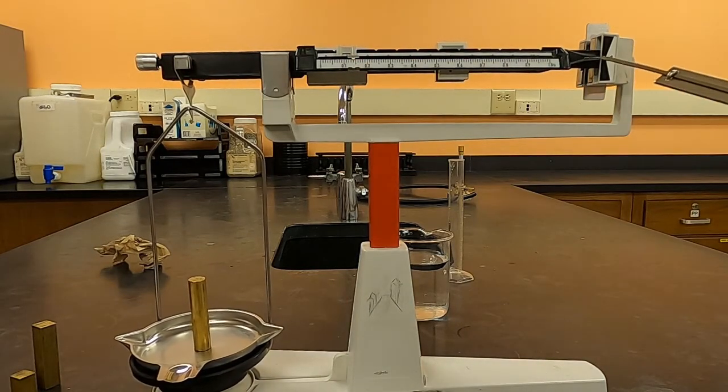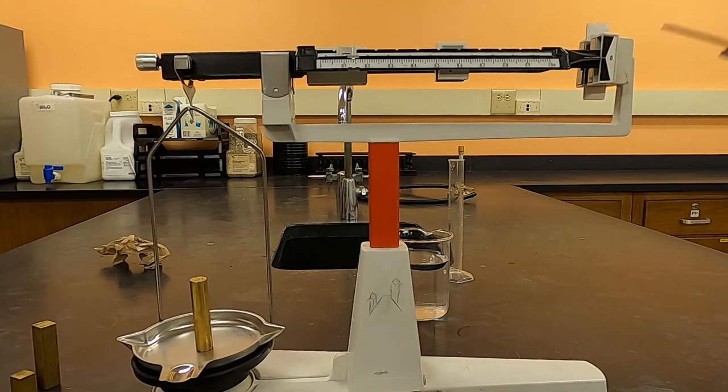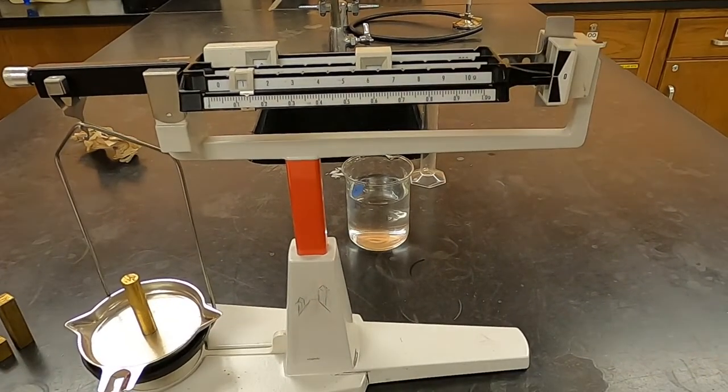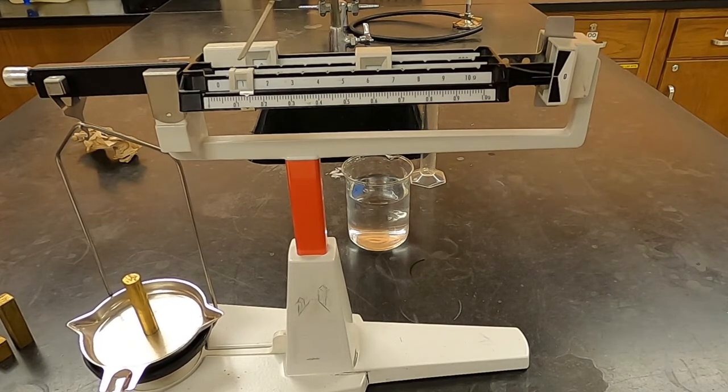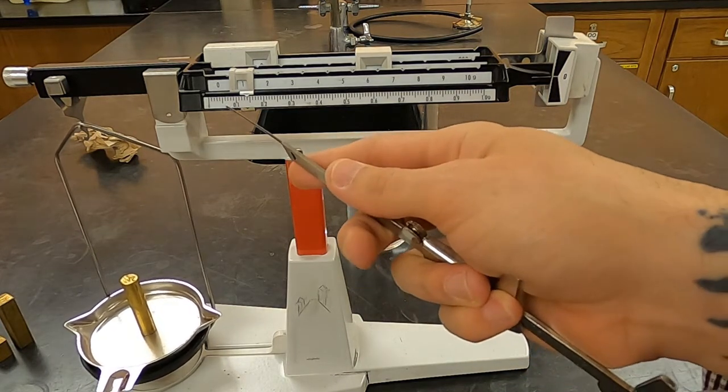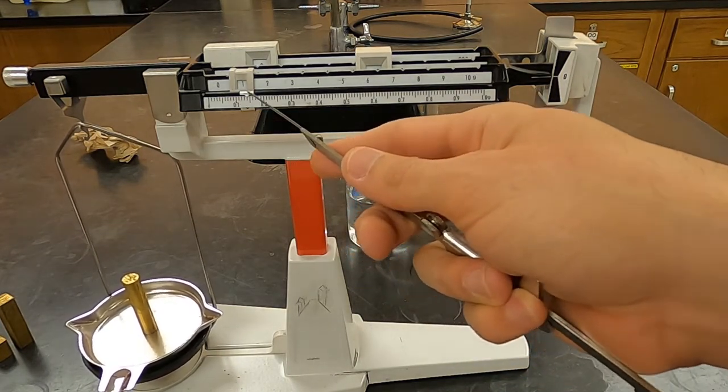Now that I've gotten this to balance with these two lines, I'm going to read the measurement. 0 for the hundreds place, 6 for the tens place, a 1 for the ones place, so it's 61 point something grams. The tenths place is going to be 0.1.